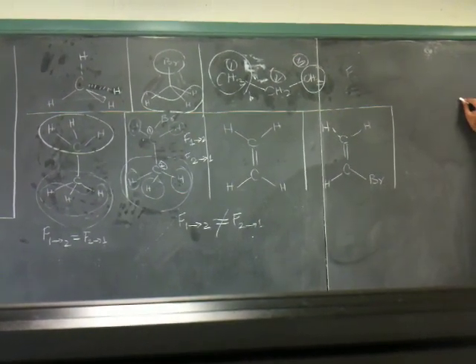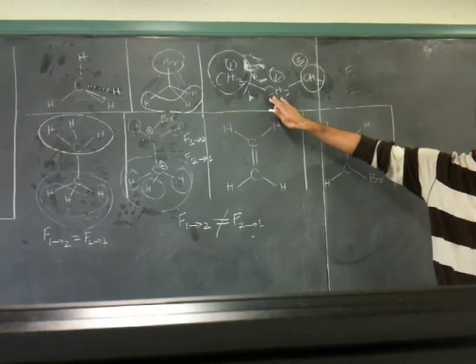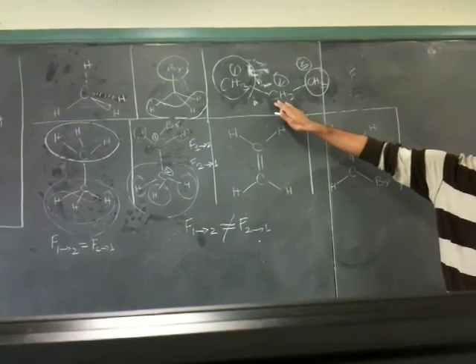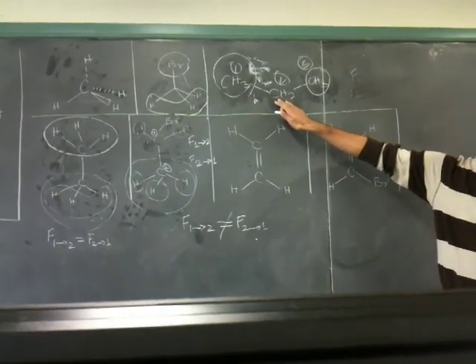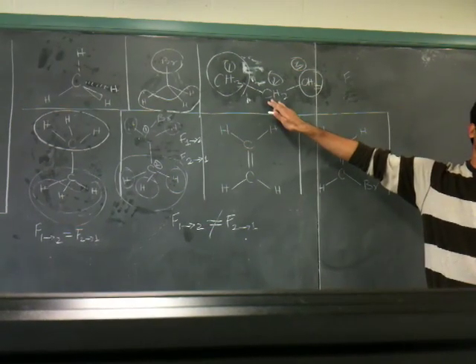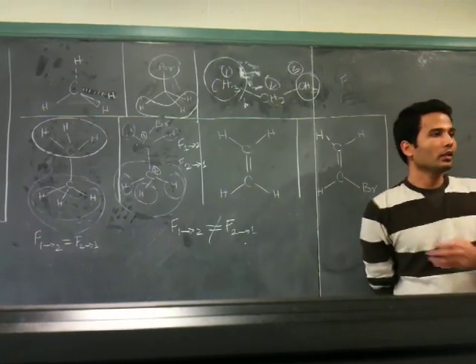Well, I'm looking at this one, that would be considered a non-polar molecule, correct? Yeah. Because both the CH3s exert the same amount of electronegativity, they have the same charge that they exert on the CH2 that has a different electronegativity. So you have 2 groups with the same electronegativity, and one group is different.